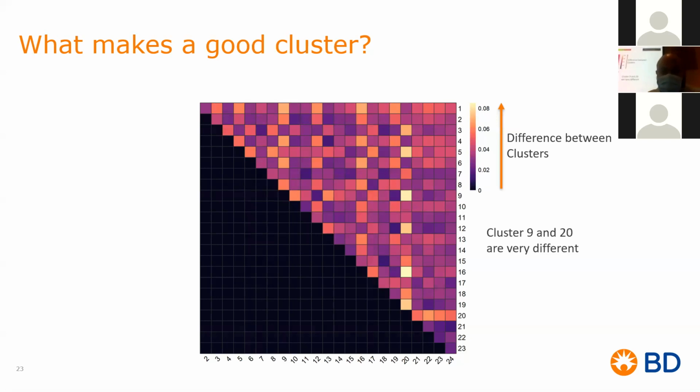So what am I looking at here? Well, if you notice, cluster 9 and 20. So let's go cluster 9. Here we go.